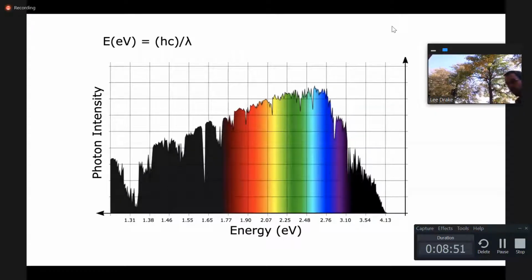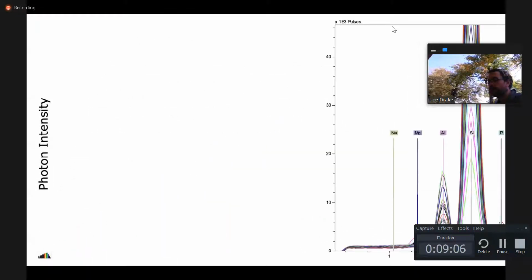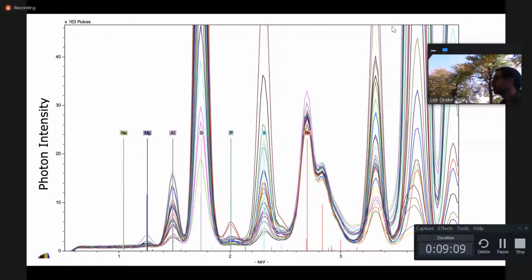Now, how does X-ray fluorescence play into this? Well, just like color fluorescence, we're going to have the physical manifestations of fluorescence. But instead of 1.7 to 3 electron volts, we're going to be working with 1,000 to 40,000 electron volts. And instead of colors like red, green, and blue, we're going to have colors like sodium, aluminum, phosphorus, and sulfur. And these can tell us the composition of objects. It can also tell us about the substrates that are on top of objects. It conveys a great deal of information about the objects we work with.